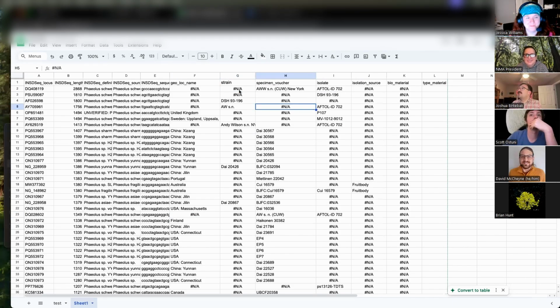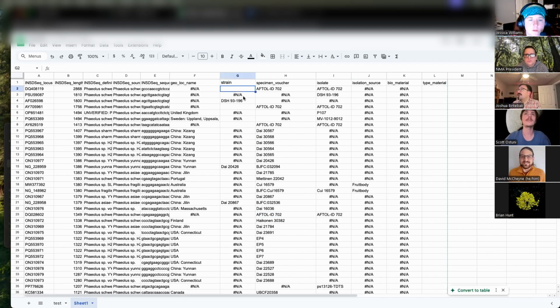Basically, what I'm going to do is, now that I've gone through and pasted all these as values, it's no longer the XLOOKUP. So now I can essentially be like, you know what? I want to call all of these this. And I don't want to have to deal with any of the rest of this nonsense. I'm just going to go ahead and delete this.